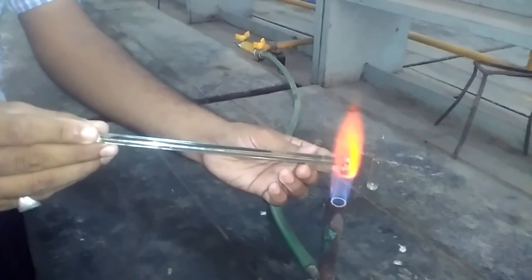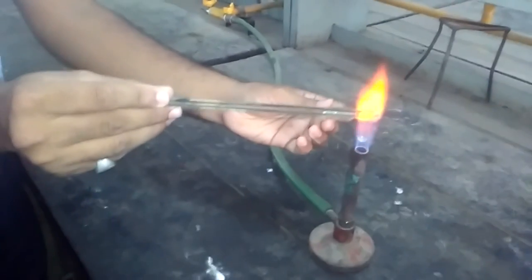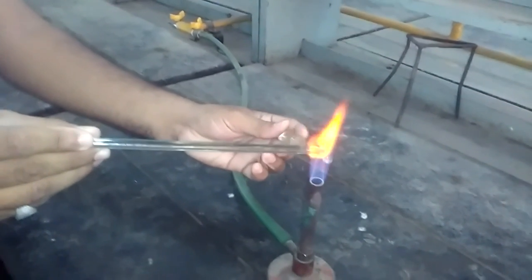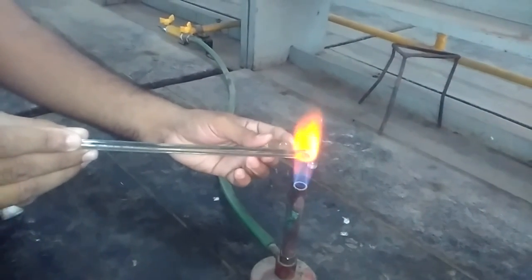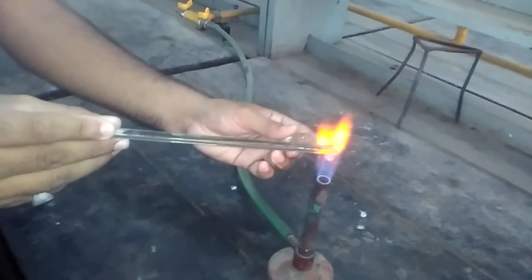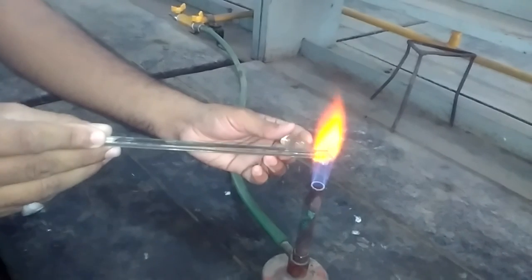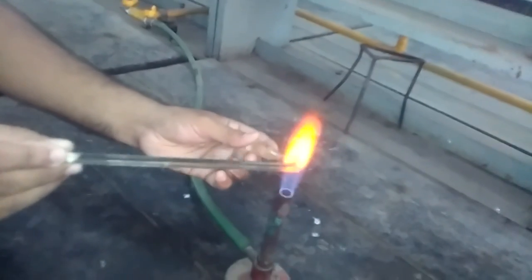Simultaneously heat the ampules and glass rod in the flame. Keep the ampules rotating like this. Heat for some time until the tip of the ampule is red color. You can see here, the tip of the ampule is red color — red hot.